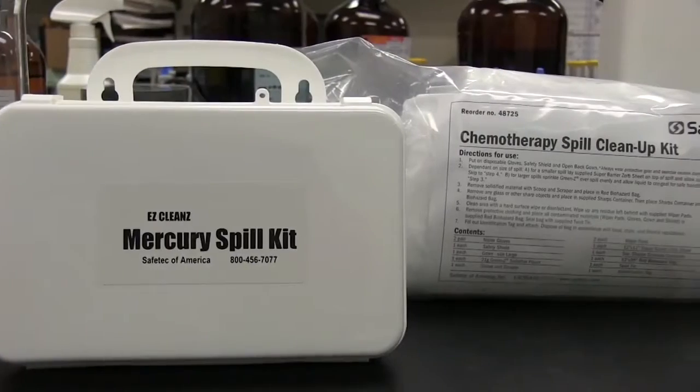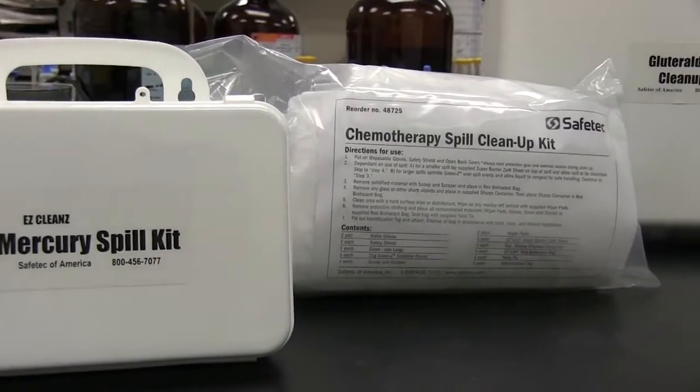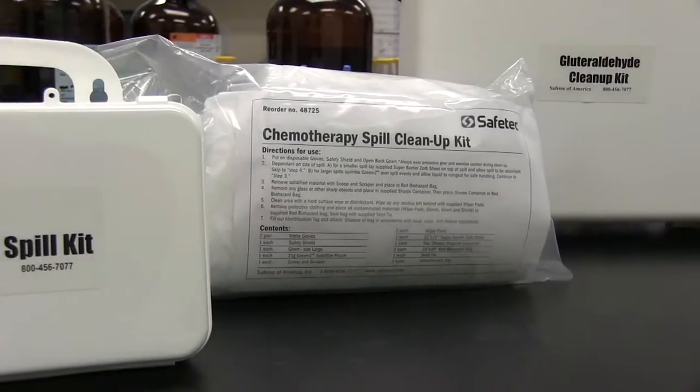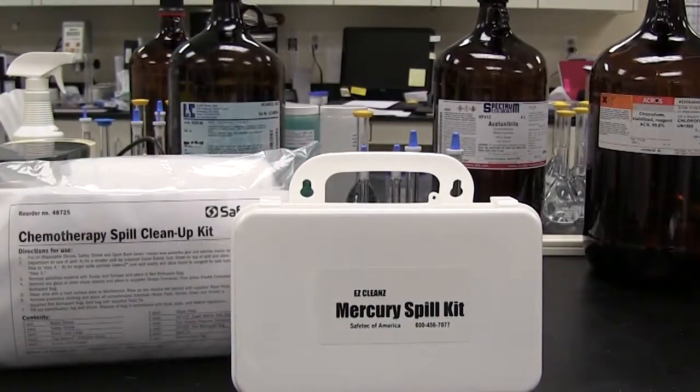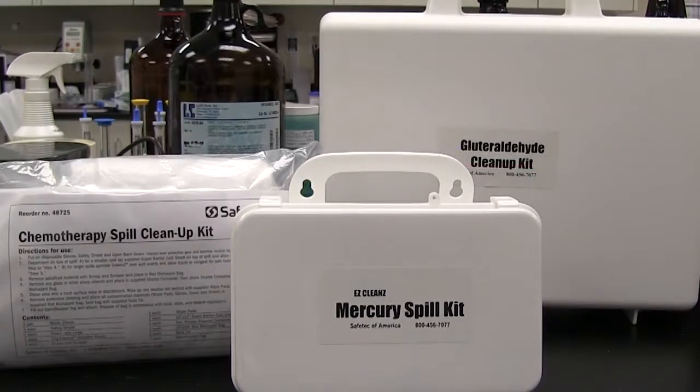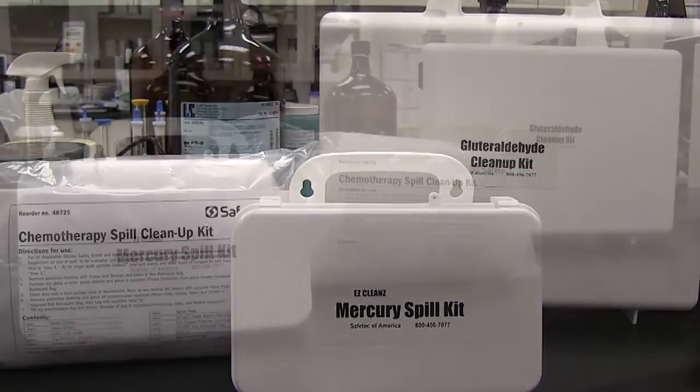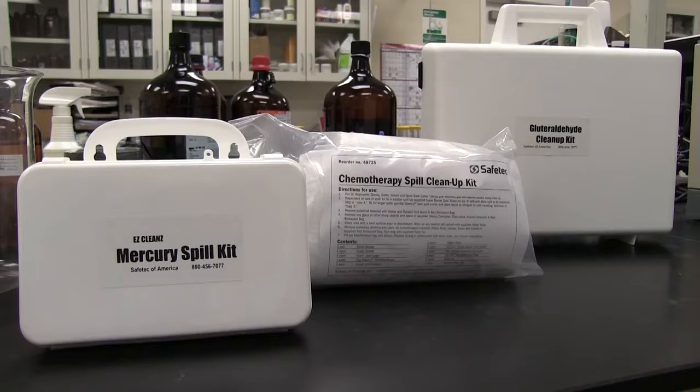To further help in the cleanup of chemical spills, Safetec has developed three types of spill kits: a mercury kit, a chemotherapy kit, and a glutaraldehyde kit. These three kits all contain Green Z, personal protection, and disposal components.